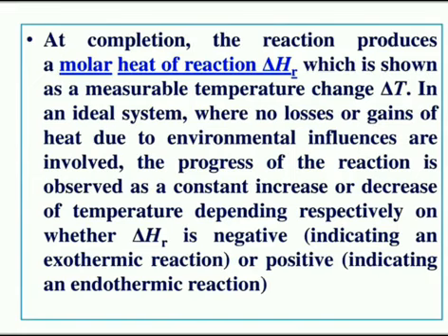At completion of this reaction, the reaction produces a molar heat of reaction, that is change in enthalpy, which is shown as a measurable temperature change. If you take an ideal system, there are no losses or gain of heat due to environmental influences, and the progress of the reaction is observed as a constant increase or decrease of temperature depending respectively on whether delta H is negative or positive.